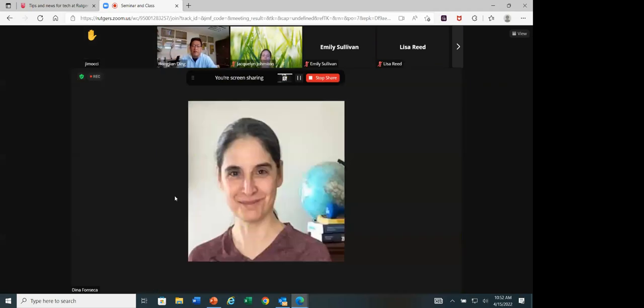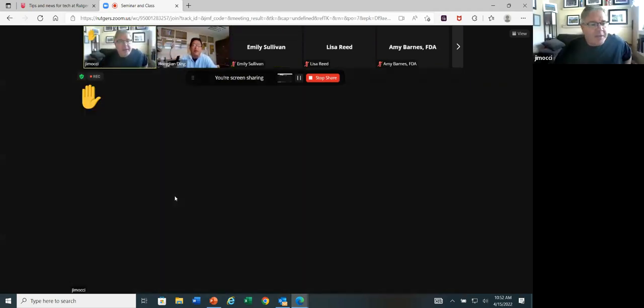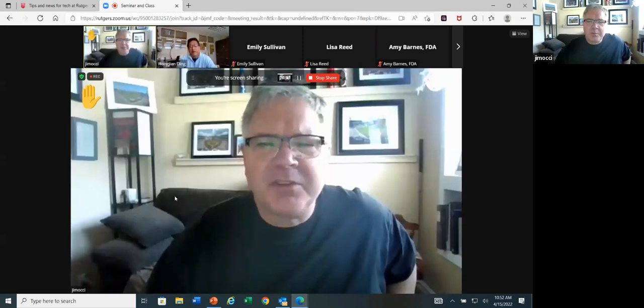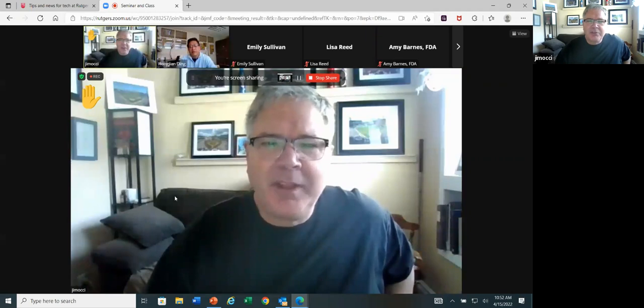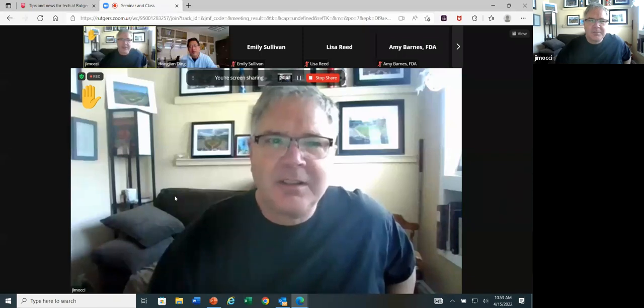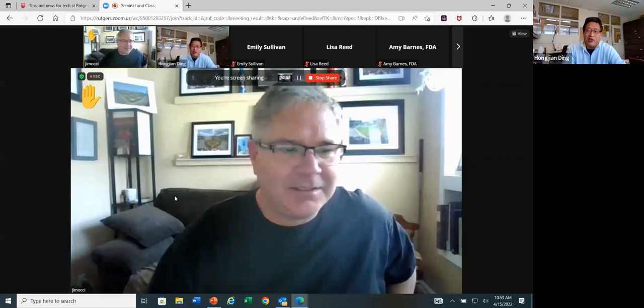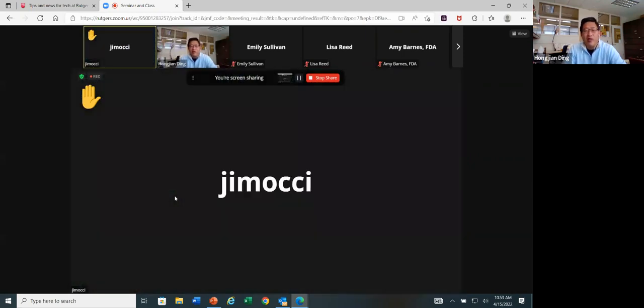Jim has his hand up. Hi, Dr. Ding. I may have missed this, but there's a lot of food produced in this country. What percentage of the food gets screened, and is it screened by the manufacturer, or does the FDA do it all? That's a pretty big question. To tell you the truth, you probably won't believe it: we only screen about 2 to 5%. Wow.